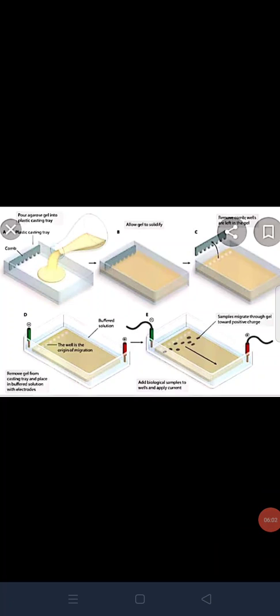As in a sieve, the large particles stay above and the particles which are smaller than the pore size pass through it. Similarly, in the gel, the larger and bulky molecules stay behind, whereas the smaller molecules move faster and quickly towards their respective electrodes. This process may be imagined like a running competition. The one who is thinner and has a flexible body will reach the ending point first. They move faster than the one who is fat and bulky.